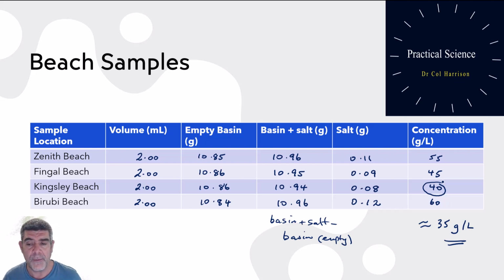They're all within much of a muchness. They're pretty close. As I say, they're probably just a little high in the salinity values, but they're certainly within the ballpark. And I think there's enough for us to be able to say there isn't a significant difference in the salinity of the water in the different beaches based on our gravimetric analysis, although there are some minor variations that may have had to do with some of the recent rain that fell.